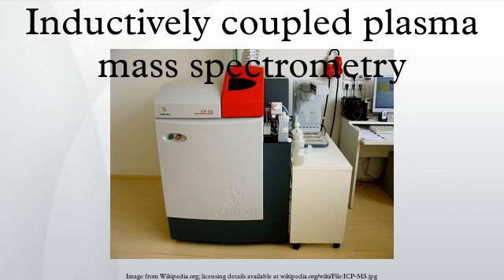Components: inductively coupled plasma. An inductively coupled plasma is a plasma that is energized by inductively heating the gas with an electromagnetic coil, and contains a sufficient concentration of ions and electrons to make the gas electrically conductive. Even a partially ionized gas in which as little as 1% of the particles are ionized can have the characteristics of a plasma. The plasmas used in spectrochemical analysis are essentially electrically neutral, with each positive charge on an ion balanced by a free electron.